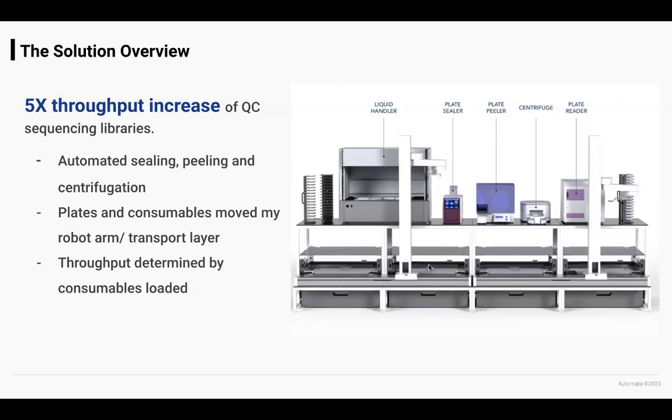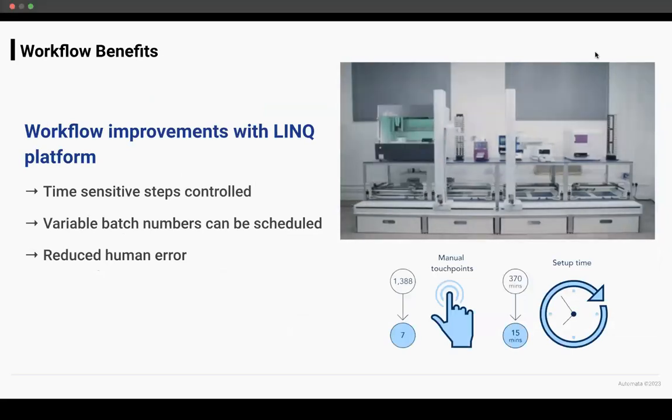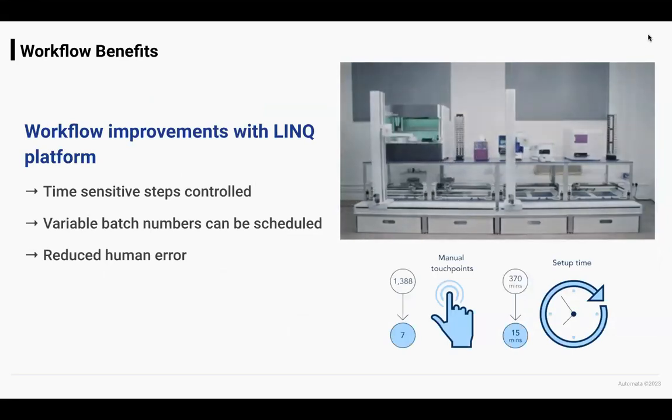So what are the actual benefits of this to the workflow? Because, apart from it being nice to not have to do things, there are other aspects that actually make it more worth the time. I've just included a GIF here of that solution running, to give an idea of how these 2 robot arms can work at the same time, because that allows you to increase your throughput. You could have 2 plates going through here. It's kind of like having 2 operators working on it.